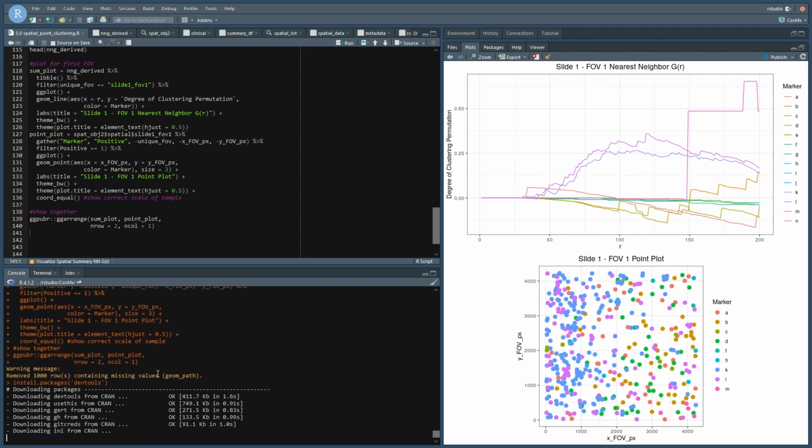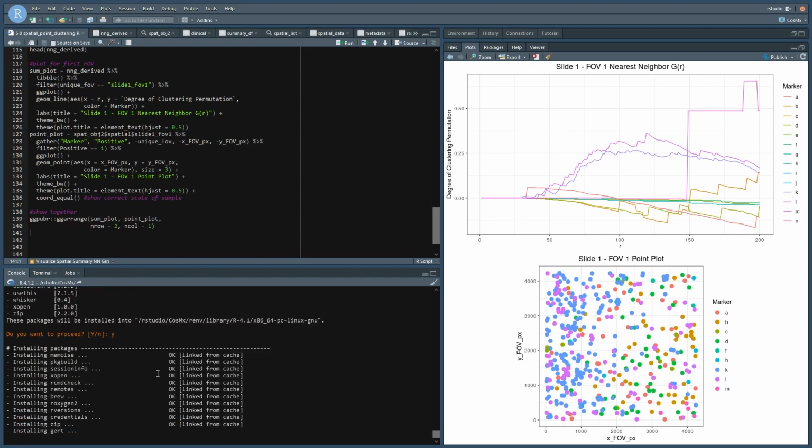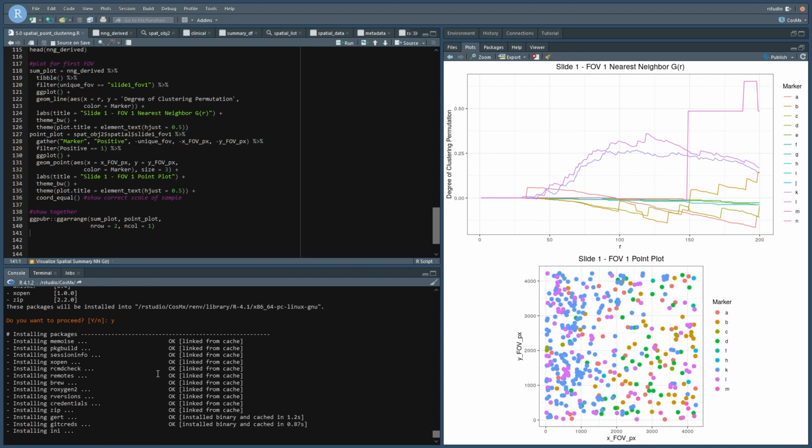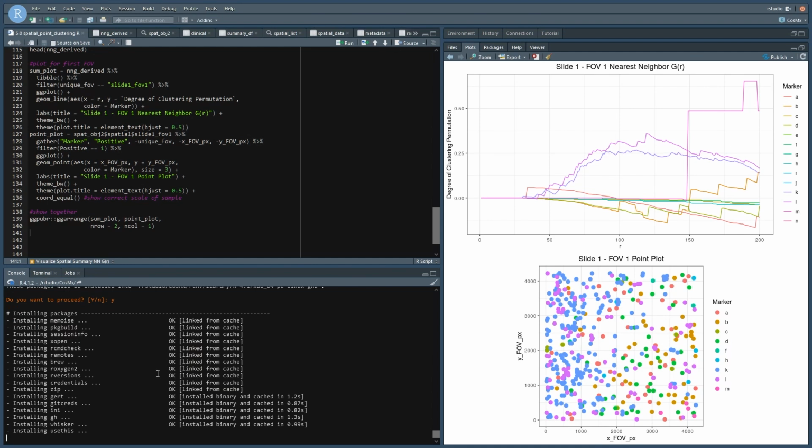The current version that is here, I don't think has the exact measure for Ripley's K, which is unfortunate because for those that are using Ripley's K, you don't need permutations in order to calculate that degree of clustering anymore. You get an exact sample-specific measure of the randomness measure.